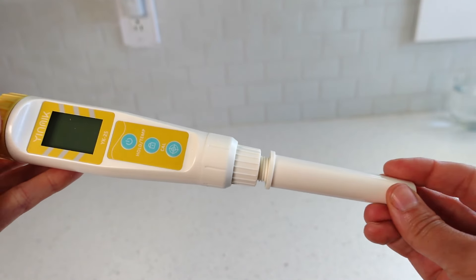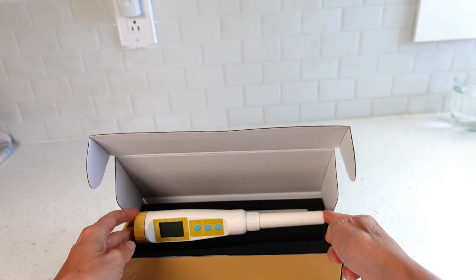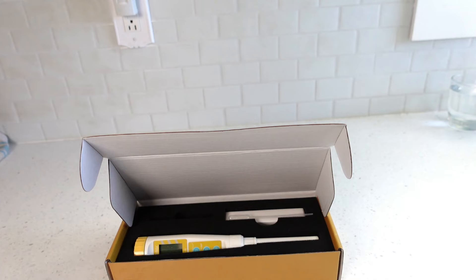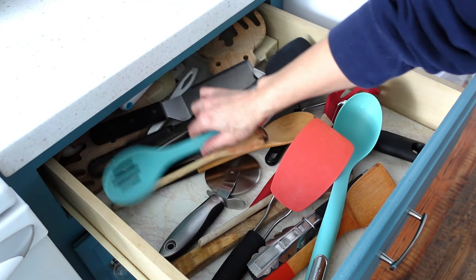Rinse and dry the meter after each use. When not in use, place the protective cover back on and store it in its original box. This will protect it from getting bumped around in a drawer, which could disturb its calibration.